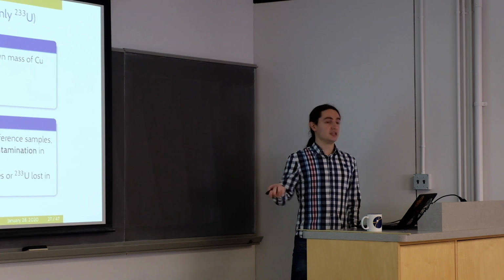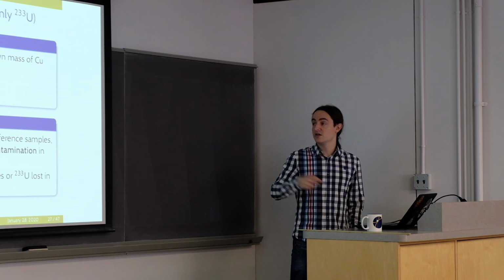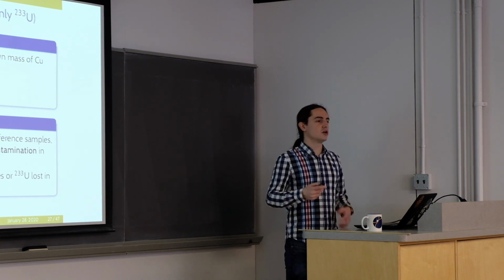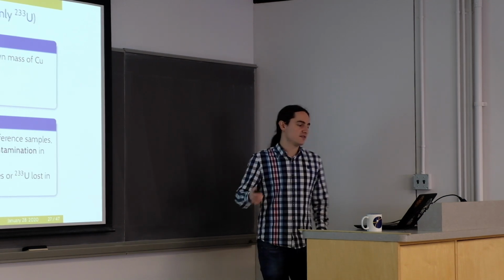The main problem is that we didn't detect the uranium-233. Maybe the homogenization didn't work, which is what I'm pretty sure happened, but it could also be that the uranium-233 got lost in the sintering process. So we had to look for an alternative.